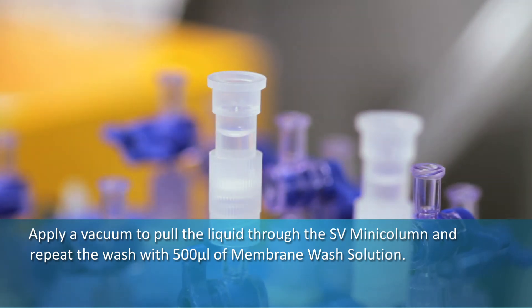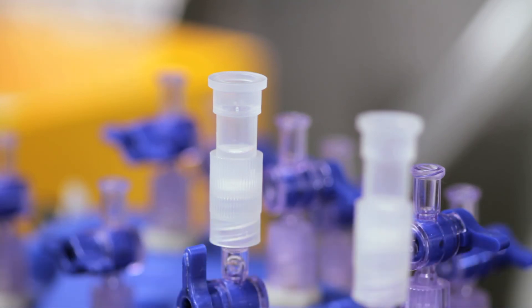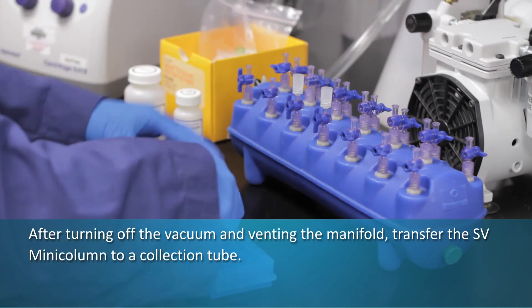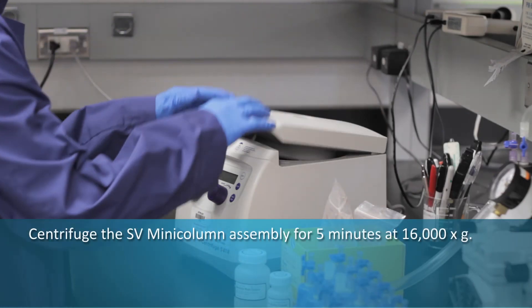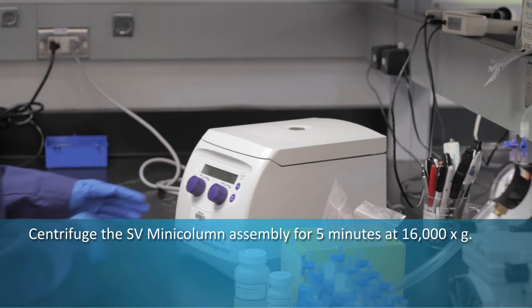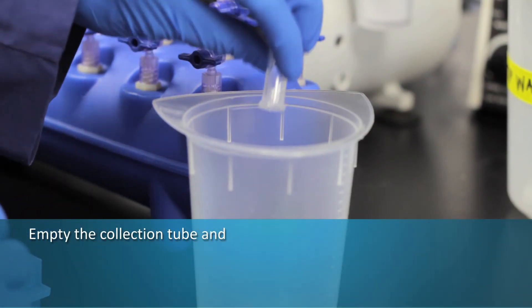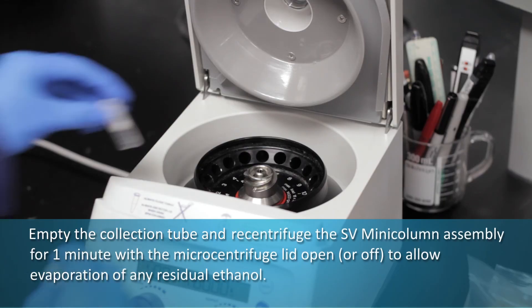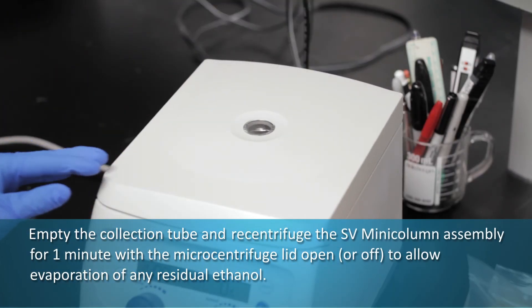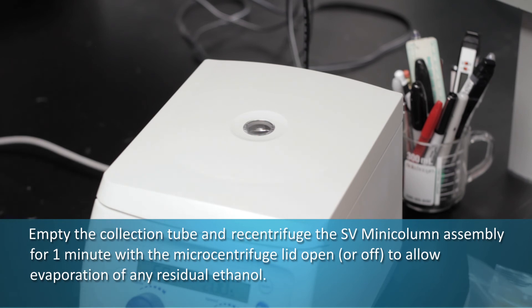Repeat the wash with 500 microliters of membrane wash solution. After turning off the vacuum and venting the manifold, transfer the SV mini column to a collection tube. Centrifuge the SV mini column assembly for five minutes at 16,000 times gravity. Empty the collection tube and re-centrifuge the column assembly for one minute with the micro centrifuge lid open to allow evaporation of any residual ethanol.